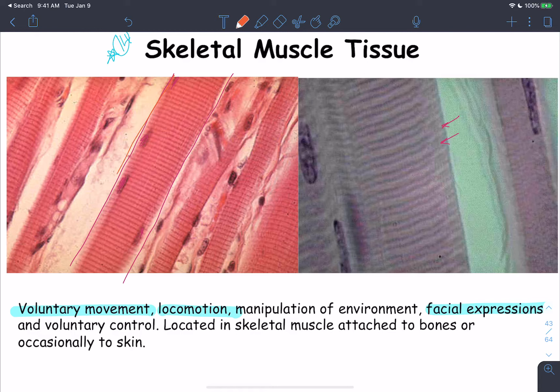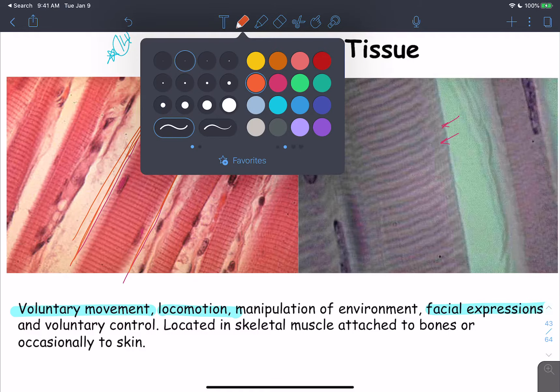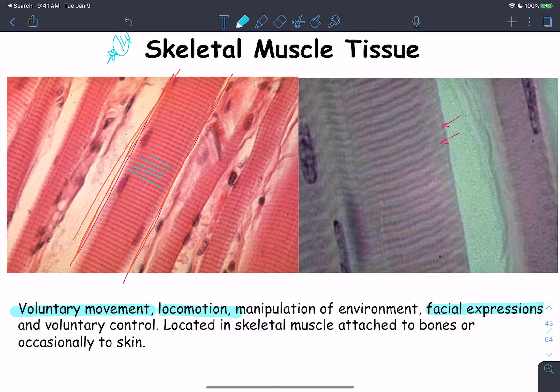Skeletal muscle tissue: cylindrical cells occupying the whole tissue, with striations showing alternating dark and light bands. Each cell has more than one nucleus — multinucleated. Skeletal muscle tissue forms skeletal muscles (along with connective tissue) and is responsible for locomotion, voluntary movement, environmental manipulation, and facial expressions. Skeletal muscle tissue is under voluntary control.